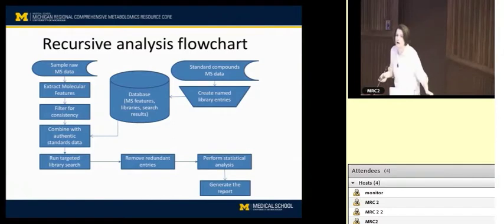Yes? For the extract molecular features, do you subtract blank?